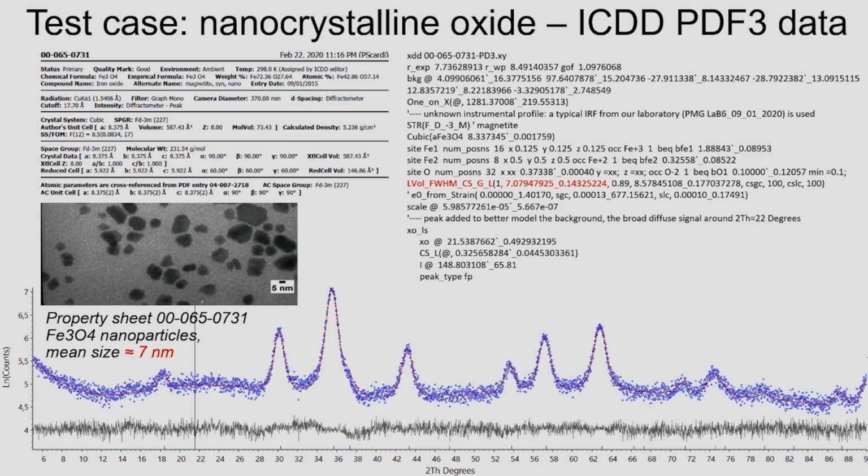It's like the TEM. I would call this a pure coincidence somehow, but in fact, this is L-vol. So at least if it is said they are more or less spherical, you should use the coefficient from the Scherrer equation, the 4/3 for spheres. And if you do that, the result is more in the order of 9.5, actually. But still, it's a reasonable agreement, and there is no microstrain.